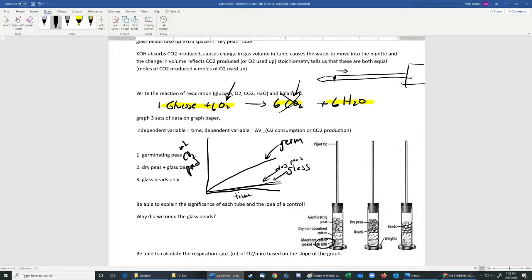So we can measure on the pipette how many milliliters, it's fractions of a milliliter. The entire pipette length was 1 ml. So if it moved to one mark in, that would have been 0.1 ml, and anything beyond that is 0.01 ml, the smaller increments.